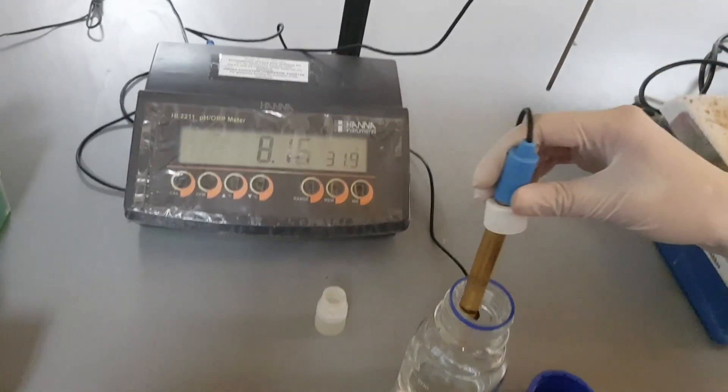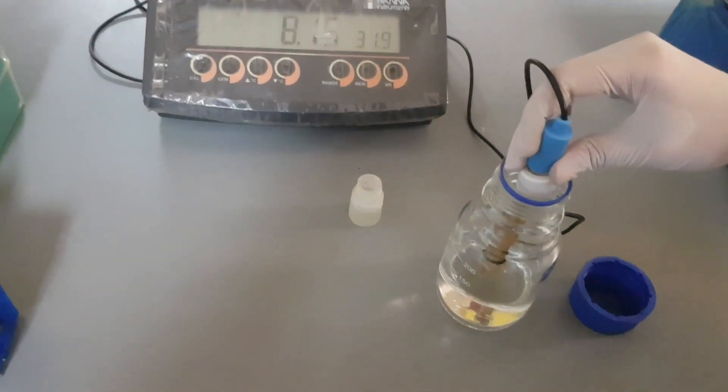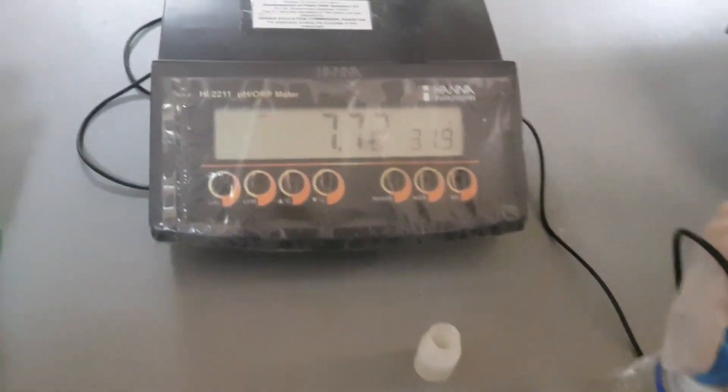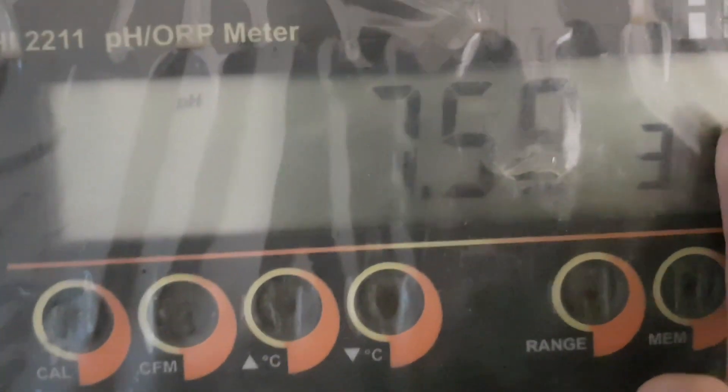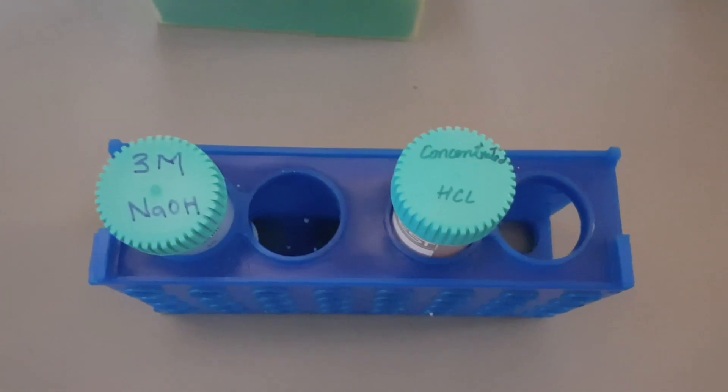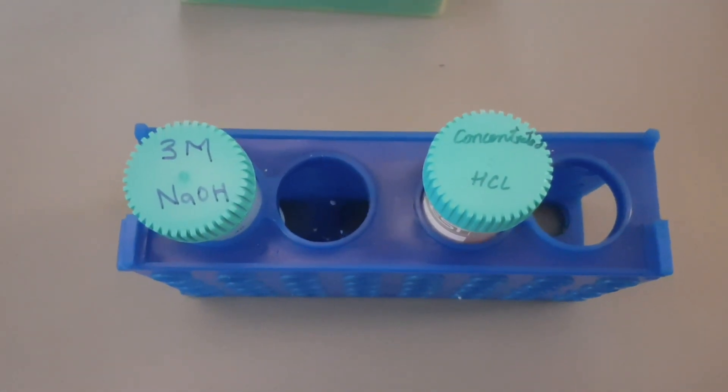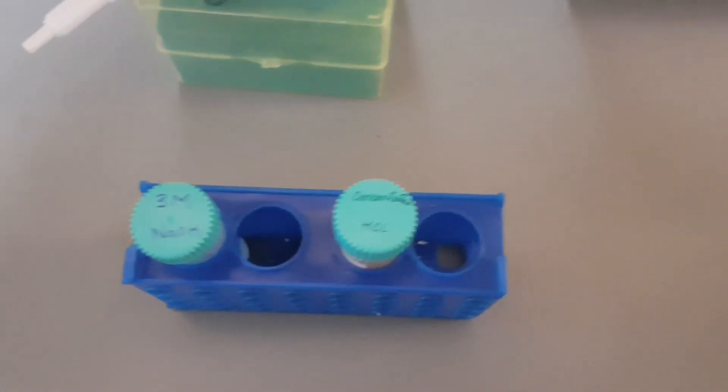By using a pH meter, now set the pH of the solution to 7.5 to 7.6. You may use concentrated HCl and 3 molar NaOH to set the pH.